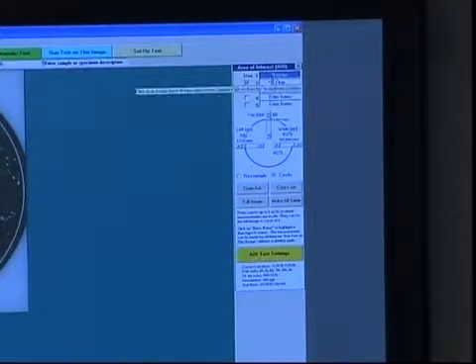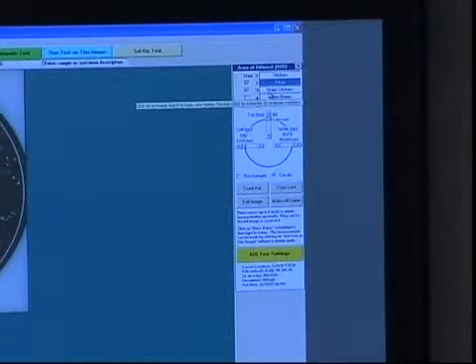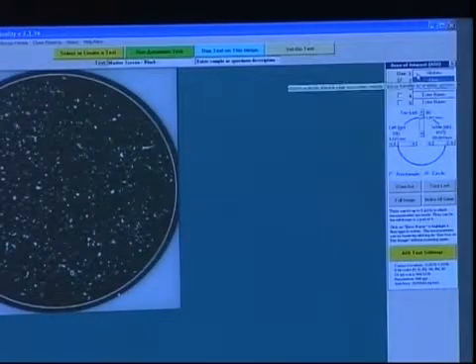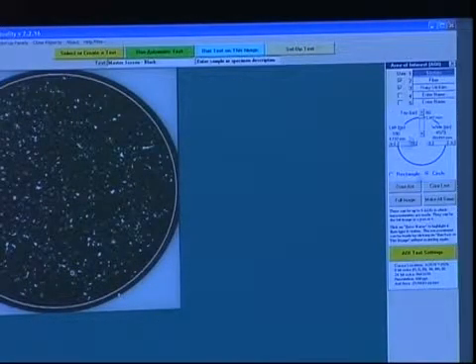We're set up to use only the first 3, stickies, fibers, and hairy stickies. We'll go into the setup. Now, each one of these has its own AOI. I don't know whether you can see the screen flicker when the new AOI comes up, but each one of them has exactly the same AOI, or area of interest. But in the measurement, all 3 will be independent measurements.